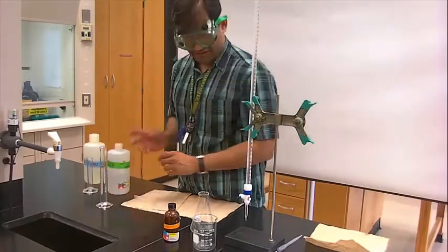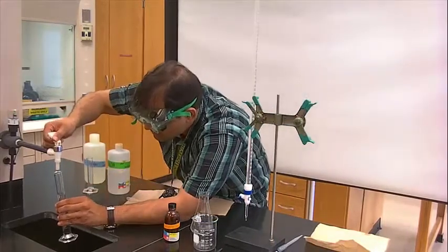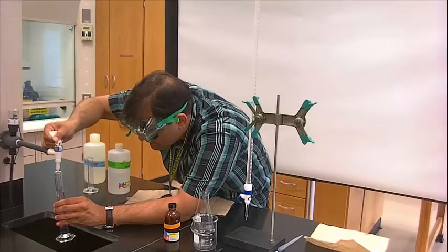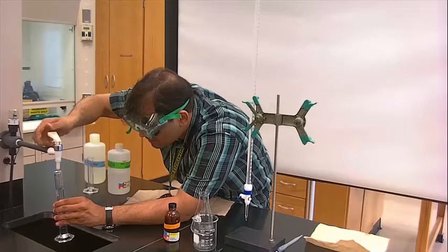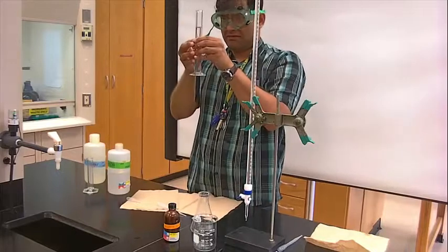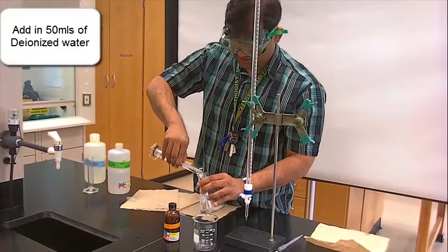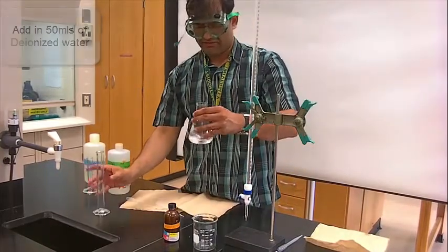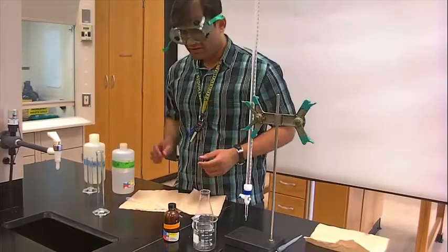And add 50 mils of DI water. I already have some DI water here. I'll just fill it up to 50 mils. A little bit more careful. That is 50 mils. So 5 mils of vinegar, about 4.9 or 4.8 to one decimal place. This is about 50 mils of deionized water. So I've diluted that vinegar.